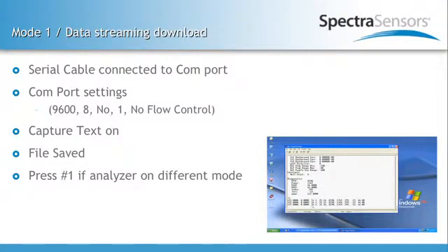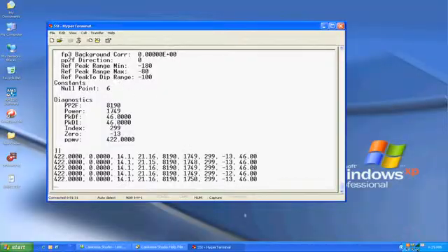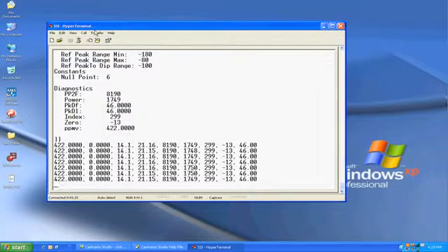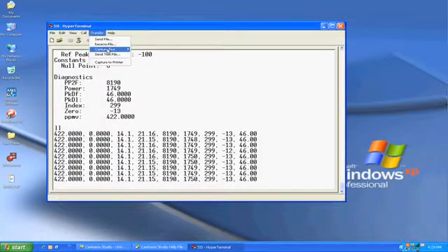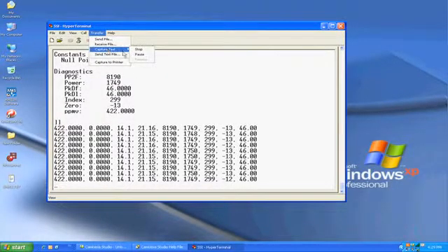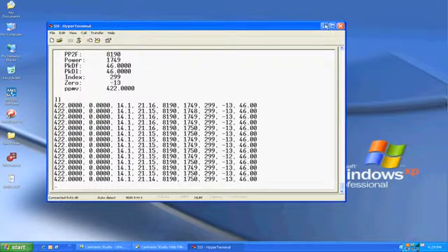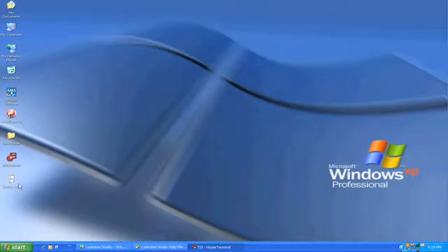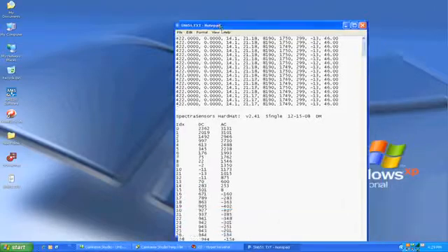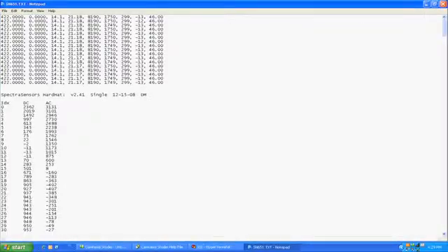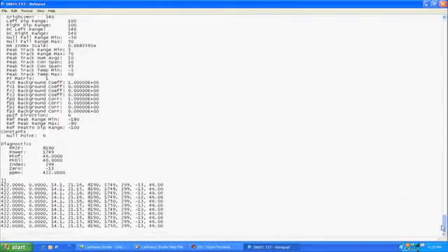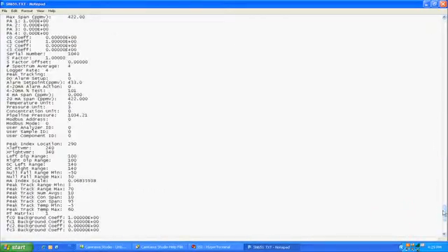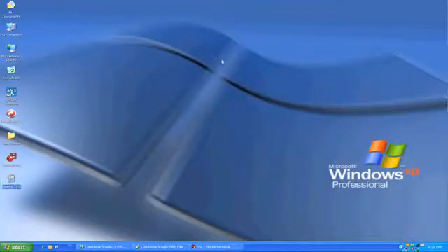Now, to stop the capture, Transfer, Capture Text, Stop. Now, you can look at the text to verify that the data you got is correct, and you would send this text file to your service engineer to look over the data.